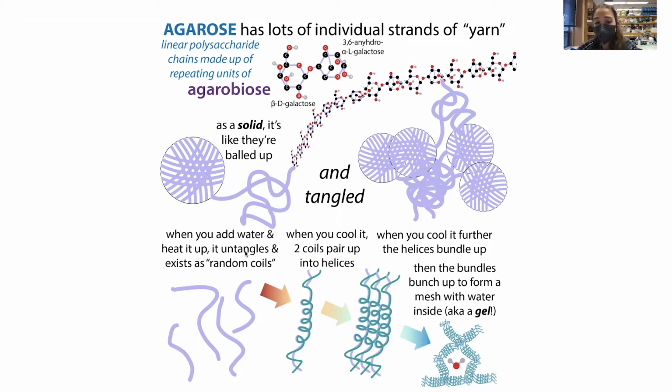At this point, what we do is we take some agarose. A typical gel concentration is about 1%. So we would weigh out a gram of agarose, stick it in an Erlenmeyer flask with 100 mL of TAE, and microwave it in spurts. I typically do 15 seconds, let it swirl, 15 seconds, swirl, probably longer in the beginning. But towards the end, you want to make sure it mixes thoroughly, but you don't want it to explode off the top or anything.